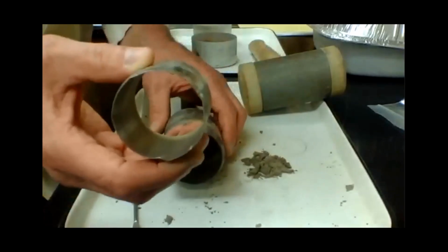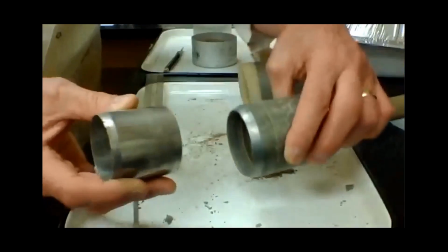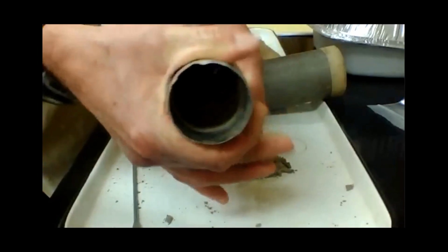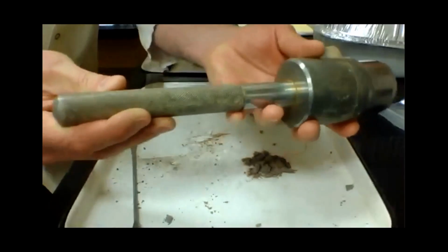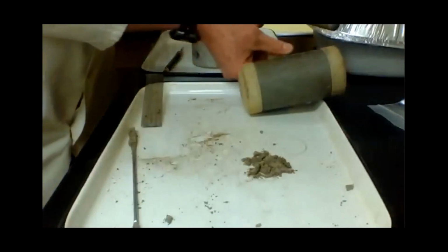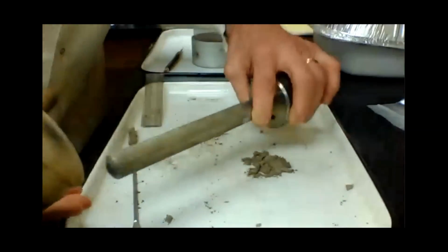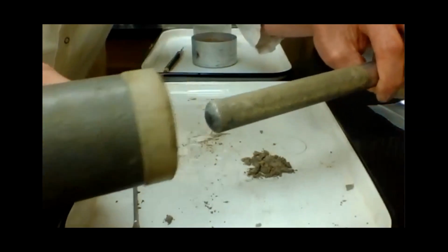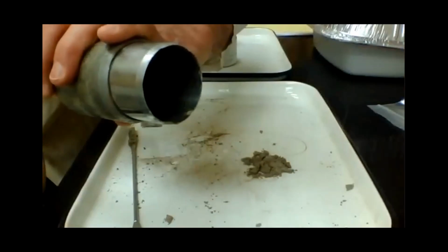So to actually take a sample, we put the sampling ring inside the bulk density sampler, and then take this in the field, either dig a soil pit or work down from the soil surface and actually hammer this in to the face of the pit.